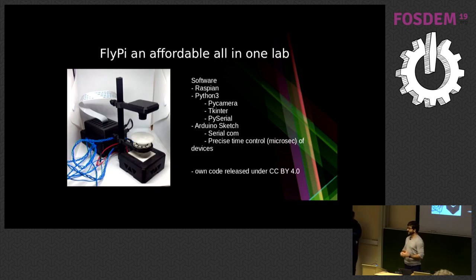Yeah. Can you compare your microscope with the commercial one? Definitely. So the question was how can I compare this device with the commercial one? Of course, we're not doing everything that a commercial one can do. So for instance, the resolution is one of those things. How far away are you from it? That's the question. We didn't find a solution yet. So I could say we're very close in terms of how many micrometers we need to break. Like in terms of there are 100 people who want to use it and it covers 99 of the cases.